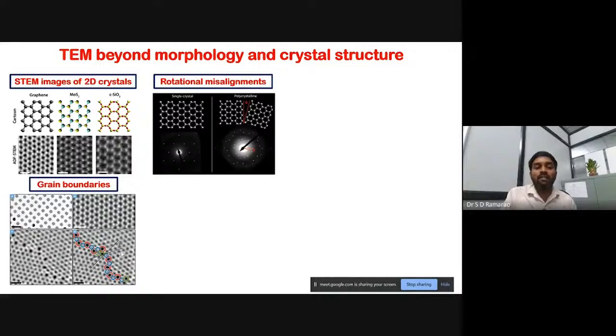And you can get how much angle both the grains are tilted with each other, and you got roughly 27. There are different software packages to analyze this data, but first getting this data is very important. For that you need very good samples and a very high-end TEM, then only can you get these kinds of images.